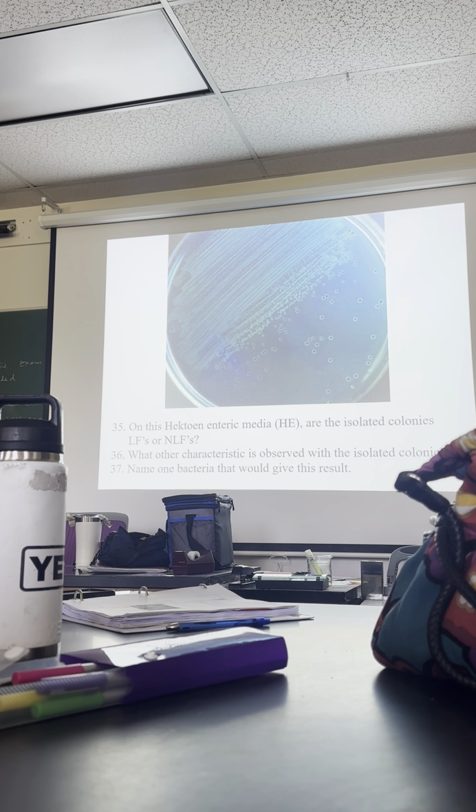So what pathogen is this representing? It's an enteric pathogen. Very common. Not E. coli. E. coli is typically not an enteric pathogen, it's mostly a urinary tract pathogen. P. mirabilis?